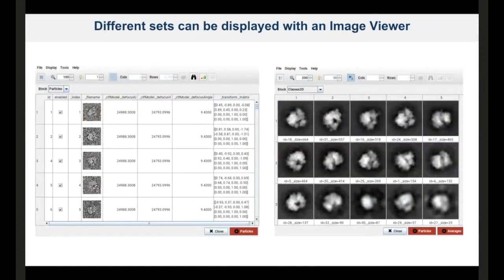Also, we have developed some graphical analysis. After you have finished computing, you could analyze the particles that have come after refinement or classification, or the 2D classes that can be grouped. And the good thing is, since we have integrated all these packages, all the graphical interfaces that are developed on this layer can be reused for any classification that is integrated. Like if you do 2D in EMAN or Relion or Xmipp, for all of them you can have the same interface or add new ones.